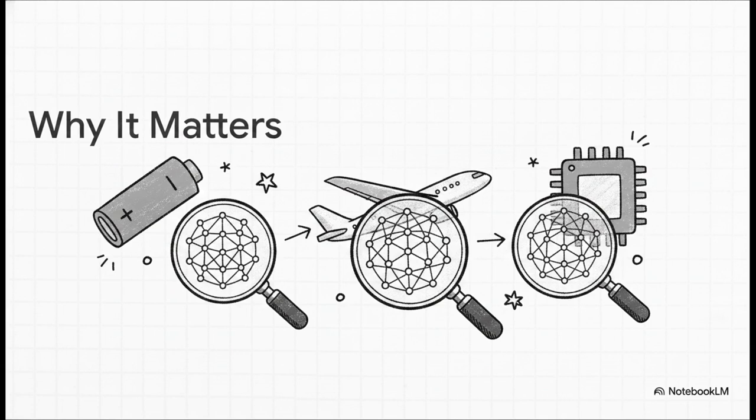So why does this matter to you and me today? Well, this isn't just some neat visual trick to print on a science poster. Correcting aberrations is an absolute necessity for modern materials engineering. It allows us to precisely measure atomic distances, identify specific atoms, and relate a material's physical properties directly to its structure. If you're out there developing new batteries, or stronger aerospace alloys, or next-generation microchips, and you can't see the structure at the atomic level, you literally only have half the information. This breakthrough was, without a doubt, the ultimate game changer.